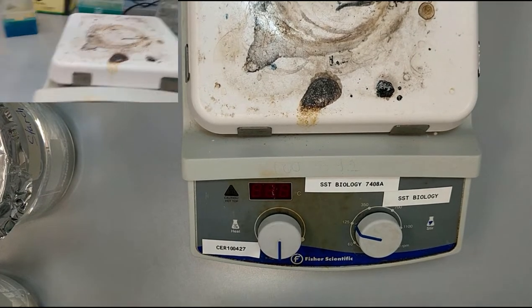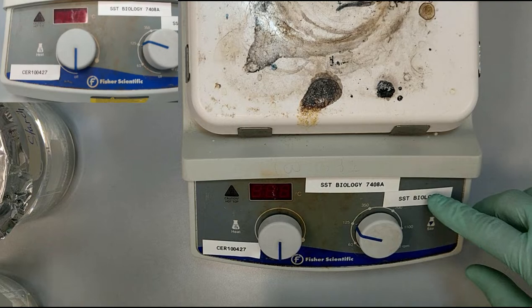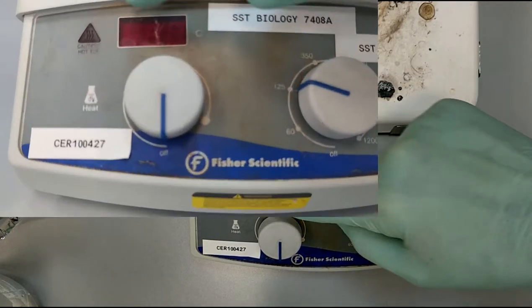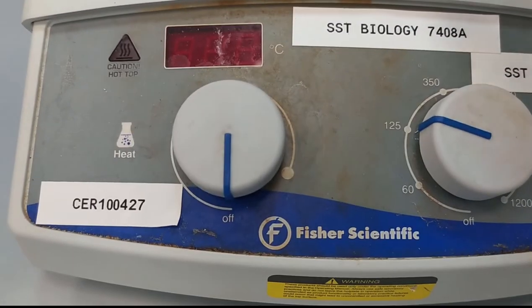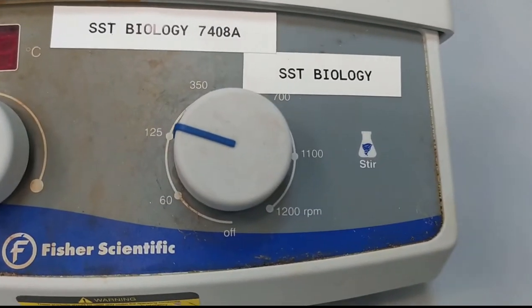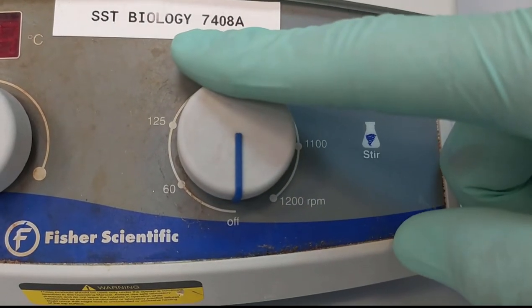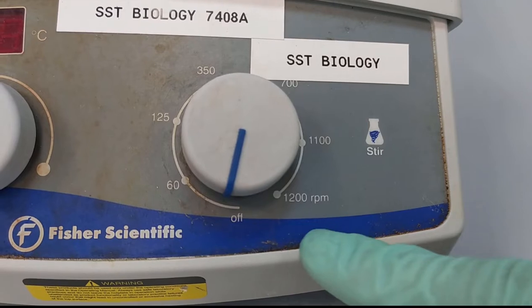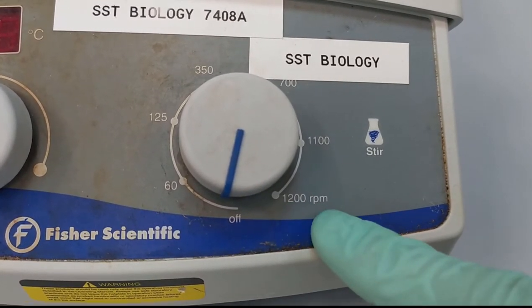So we set the stirrer in a way - as you can see here, we have two parts. One part is about the heating, the other part is about the mixing. We can set it to off here, or maximum to 1200 rotation per minute.